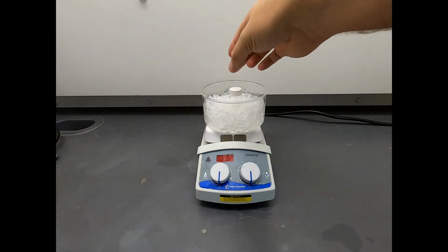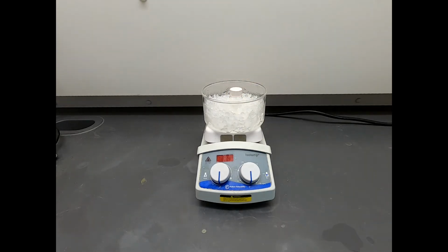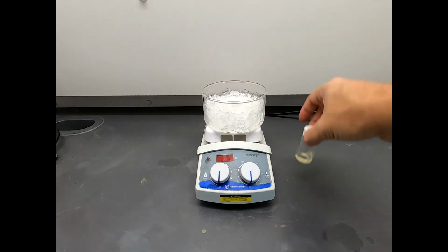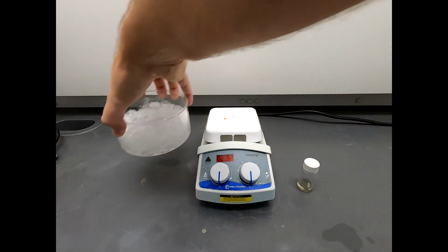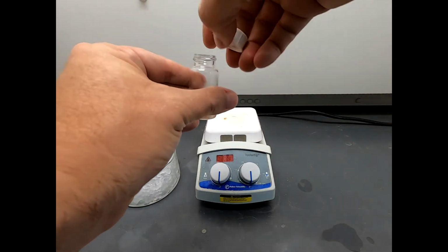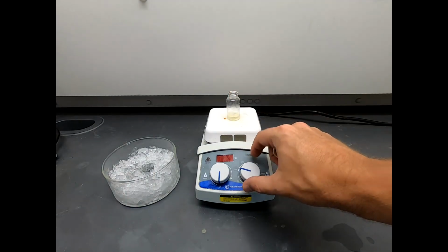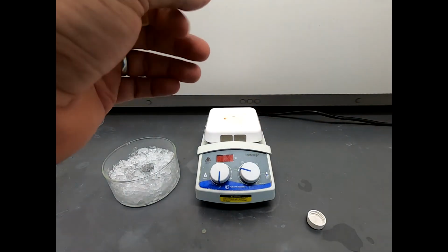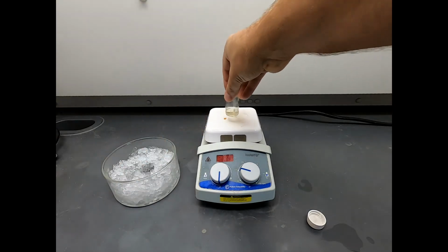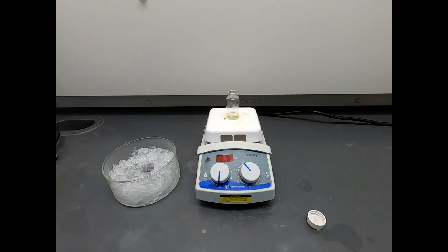So I don't want to do this. We do have a stir bar in here, so we can put that stir bar to work and stir it during the addition of water. But I don't want to do it with the ice bath here, because we can't see with the ice bath. So let's just take this off the ice for a moment. Open it up. I know it's all fogged up. Let's fix that if we can. Okay, there we go. Now we can see, kind of.